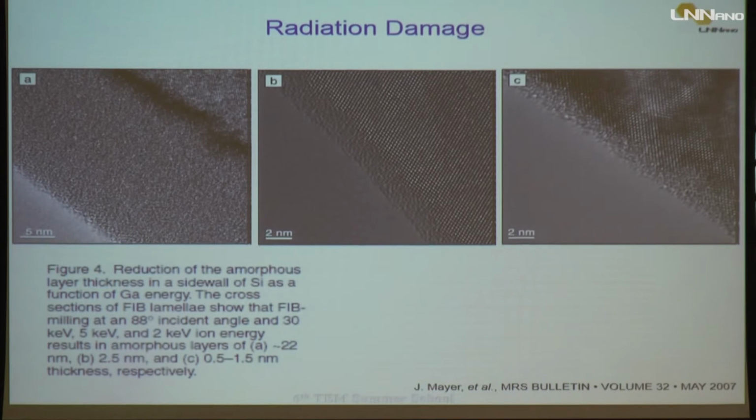Please, if you want to ask something, please ask. Well, you see, it's clear that the smaller the energy, the better the resolution in the TEM machine. For sure, by experience, it's more difficult in the preparation step to do this excellent polishing, you need to put in some effort.